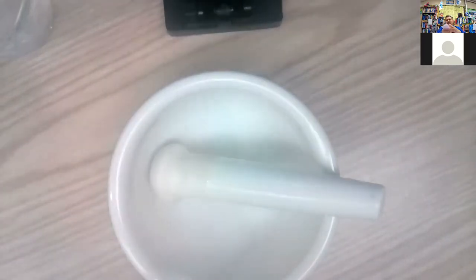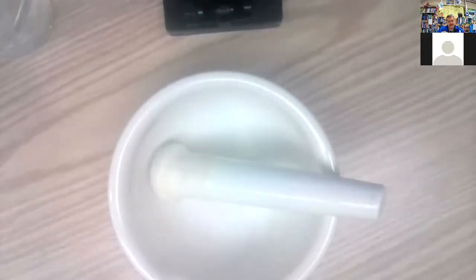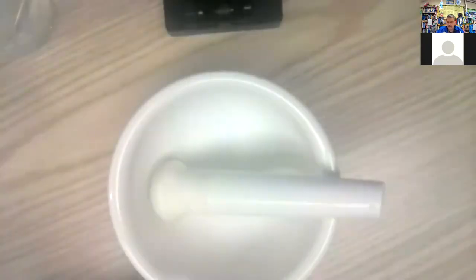I'm going to fold it in half, and in half again. You can do that hamburger, hot dog, or hot dog, hamburger. I'm doing this so that there's a crease. So once I get the powder in here, then it will be easy to use this like a spout to pour it down the paper into the balloon. Okay.